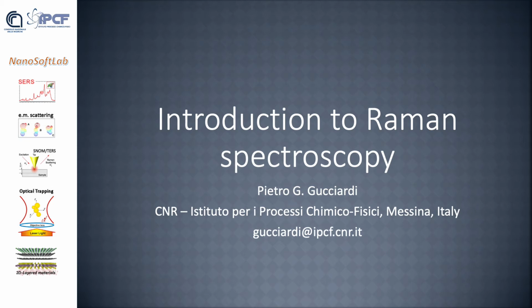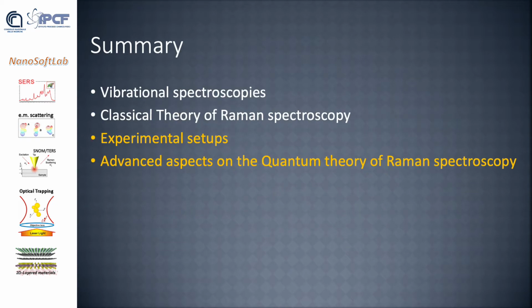Hello everyone and welcome to this second part of the lecture on the introduction to Raman spectroscopy. We will briefly discuss some experimental setup for Raman spectroscopy and imaging, and then we will go a little more into advanced aspects of quantum theory of Raman spectroscopy.